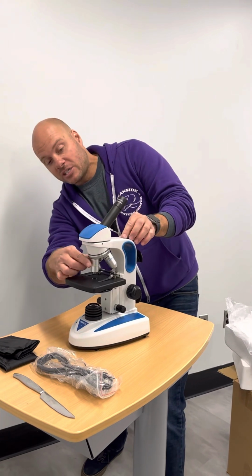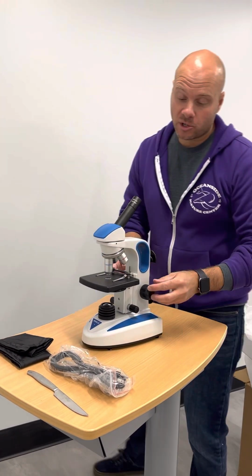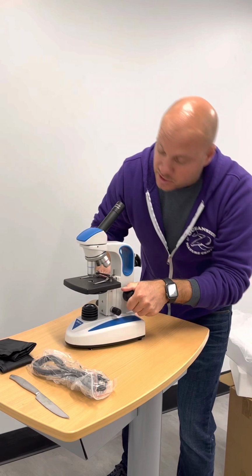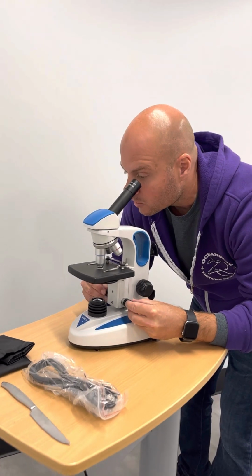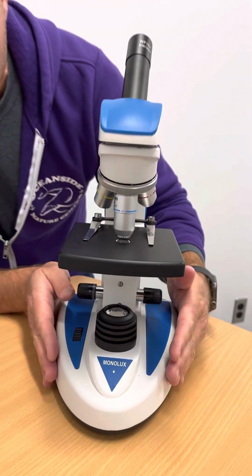But when I finally switch to high power, I will no longer use the coarse adjustment knob, because as you can see, that could smash the stage into the lens. We don't want to do that. Okay, so we're only going to use the fine adjustment knob, which is this little one, to go in and out. Okay, wow, what a beauty from the people at Monolux.